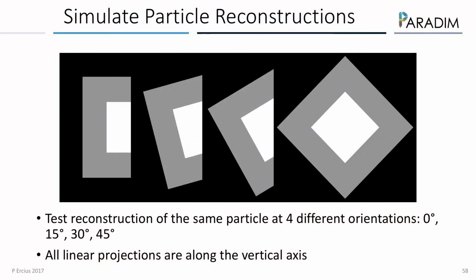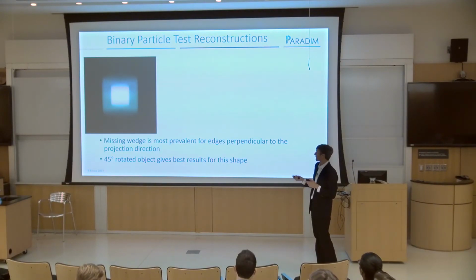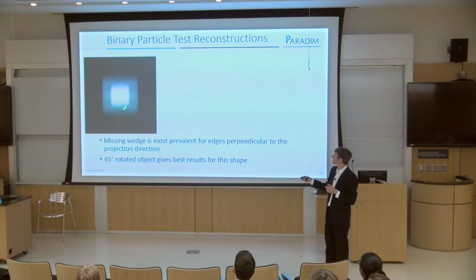And let's see how the missing wedge affects the shape of this object, OK? And I think you all guess where this is going. So this is our projection of this kind of core shell nanoparticle I made up, right? And you can see that we don't get very good reconstruction of this facet, but really good reconstruction of this facet.